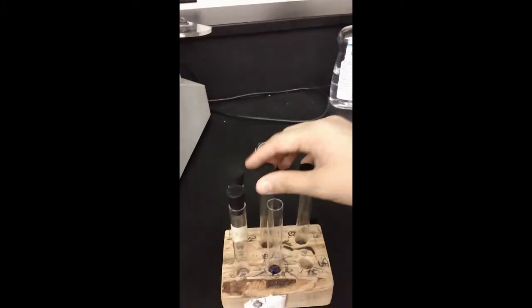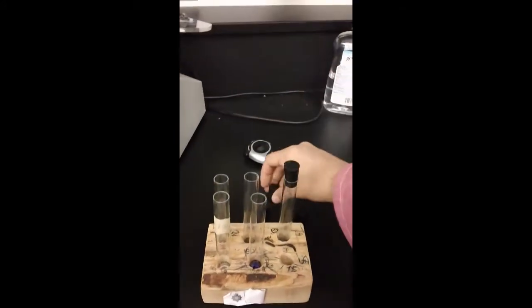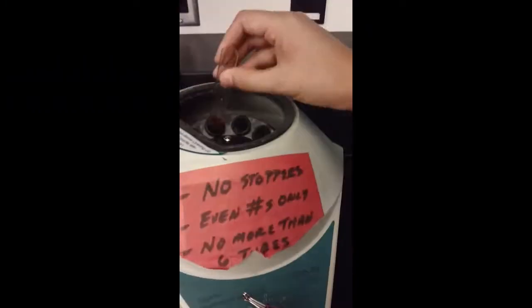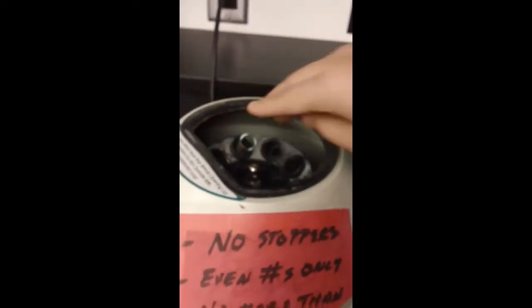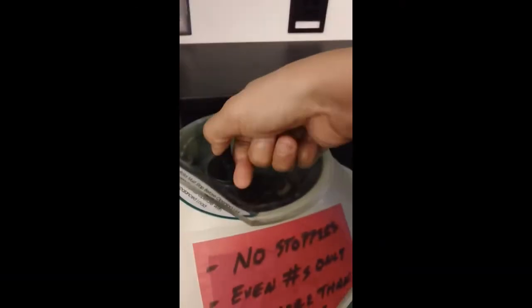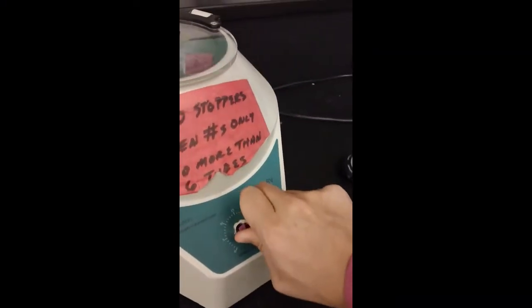We want to make sure that we're centrifuging for about a minute and that we're balancing our centrifuge, and we do not put the stoppers on when we are centrifuging. So stoppers are off, and I have to balance, so I'm going to keep them separate. Make sure I know what I have here. Centrifuging it in. They're going across from each other. So I can't put the last one in just yet because it has to be balanced. So I'll put that on. Okay. And we're going to do it for about a minute.